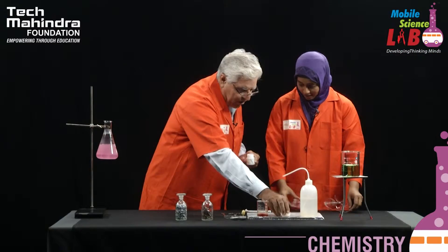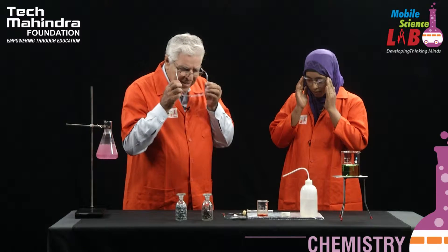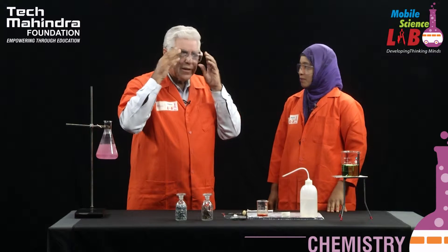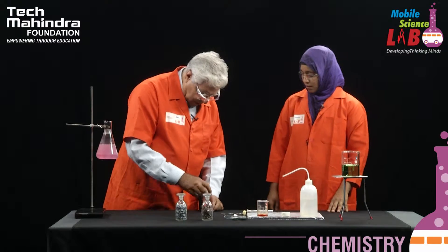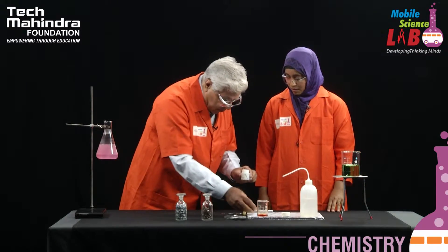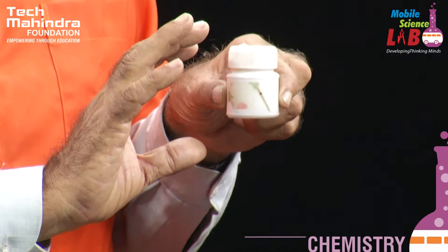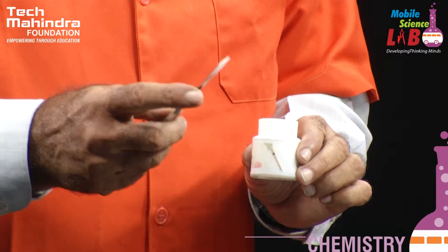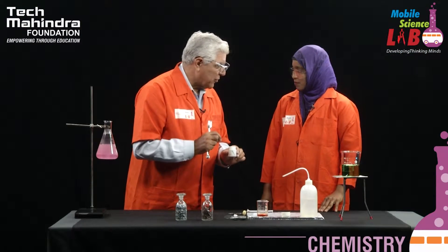Now I want you to do this experiment on your own. Both of us will have to use safety goggles, so let's put them on first. Is it going to burn, sir, or give lots of smoke? Yes, definitely there will be some reaction, and you will see that it is necessary to protect ourselves. I want you to pick up a piece of sodium and with the help of this spatula, cut it. I am very surprised — a metal can be cut with a spatula! Exactly — sodium is a very soft metal and also very reactive.